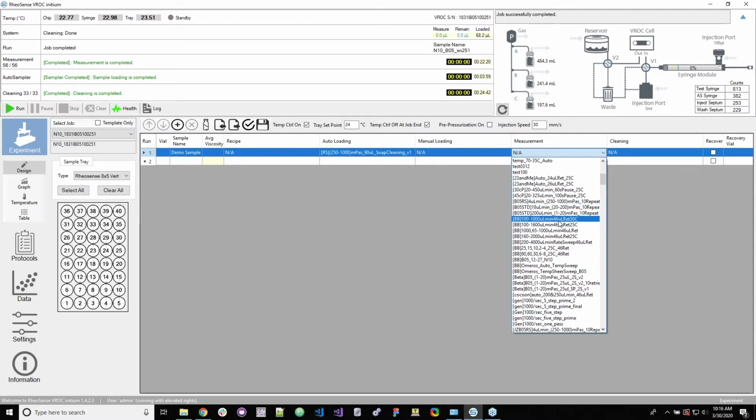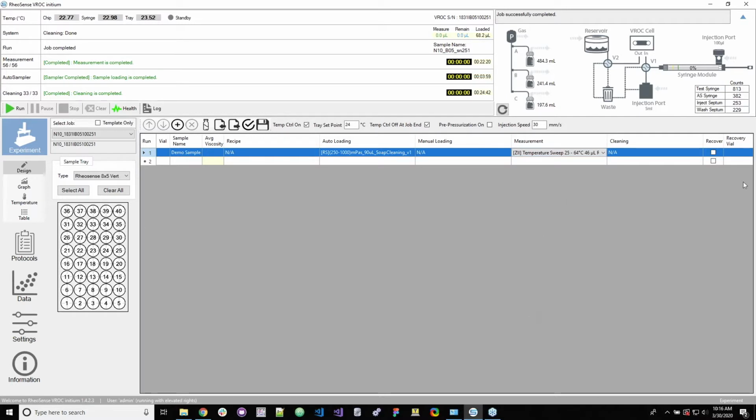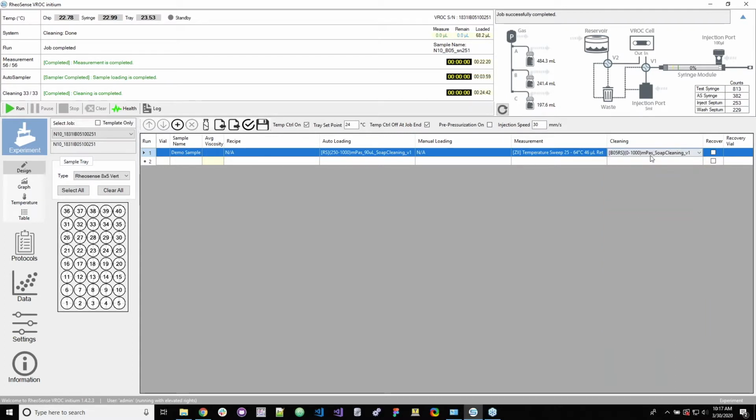So, let's see. I have a lot of protocols listed because we use this instrument a lot. So we'll just use one of mine. We'll do temperature sweep. And then for cleaning, scroll down, and we'll need to make sure that the cleaning selected here matches the cleaning in the auto sampler loading protocol. So to do that, just make sure it's the last thing in this case. Soap cleaning matches soap cleaning.